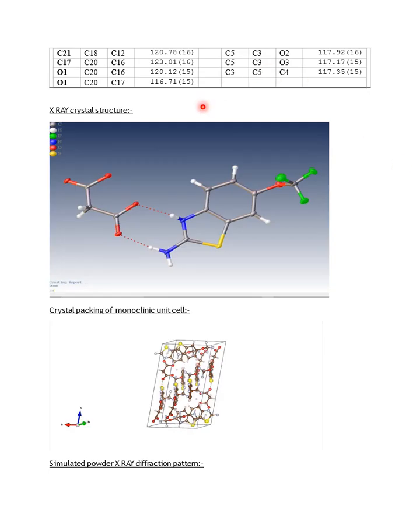And this is the expected structural refinement for dataset 2 that we have refined by using the OLEX2 software. Here the green color atoms represent fluorine atoms, blue color represents nitrogen atoms, yellow color represents sulfur atoms, gray color represents carbon atoms, and white color represents hydrogen atoms. So this is the structural arrangement of the electron densities that we obtain by using the OLEX software.